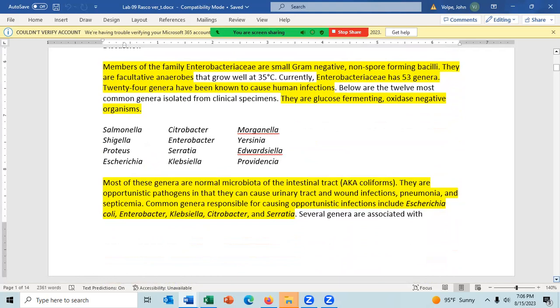Yes. So if we have a gram-negative bacteria for our unknowns project, would you want us to request, say, the methyl red test individually or as part of the group of tests? When you're requesting a test, request a specific test. IMVIC is an acronym for a group of tests which typically are used on Enterobacteriaceae. They're not used on all gram negatives. Okay, yes, thank you.